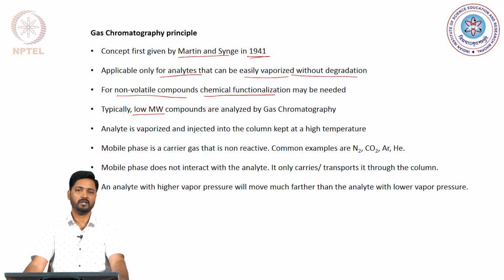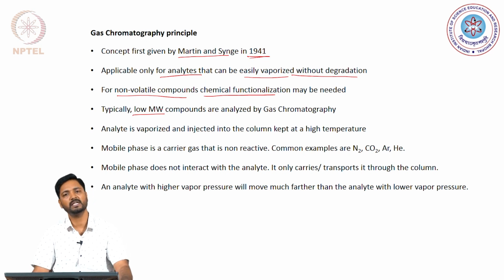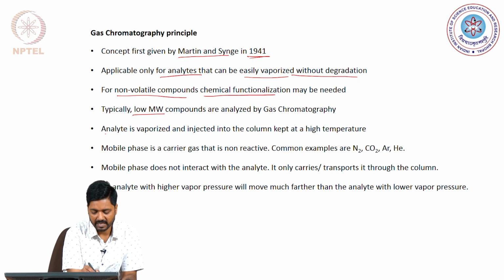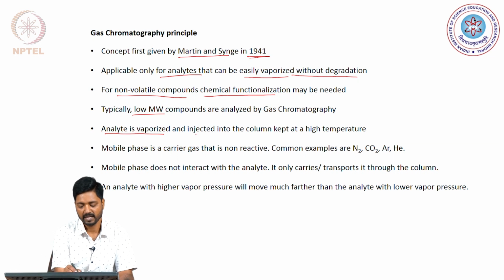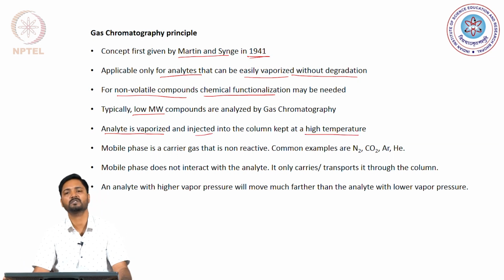Indeed, gas chromatography is applied to a large number of small molecules synthesized in organic chemistry laboratories, and here we need to vaporize the analyte and inject it into a column that is kept at high temperature. This is an important practical consideration, that our analyte will be passing through a column kept at a high temperature.